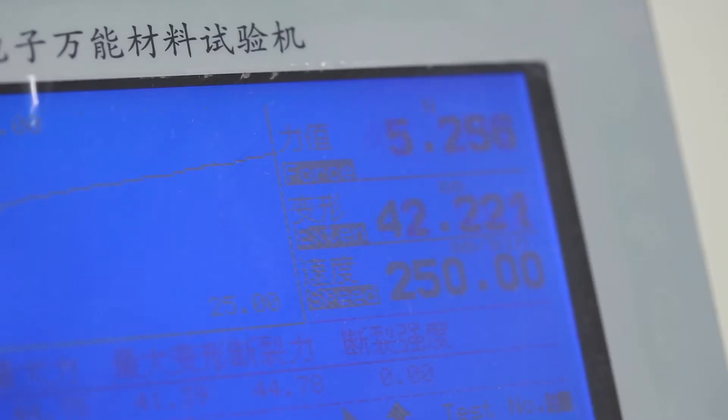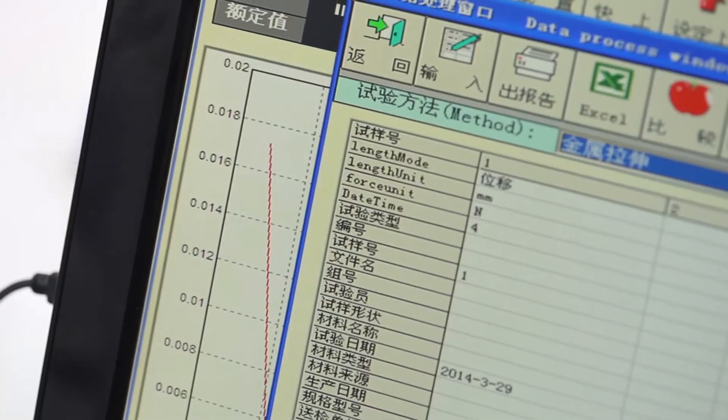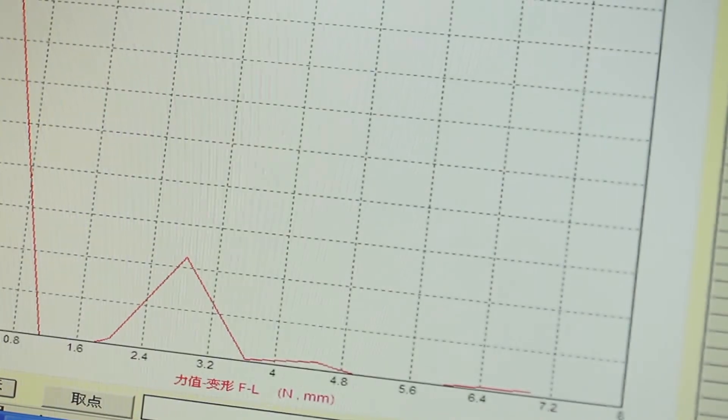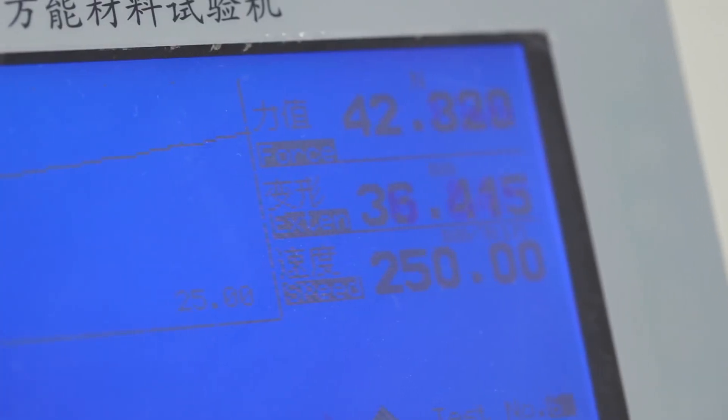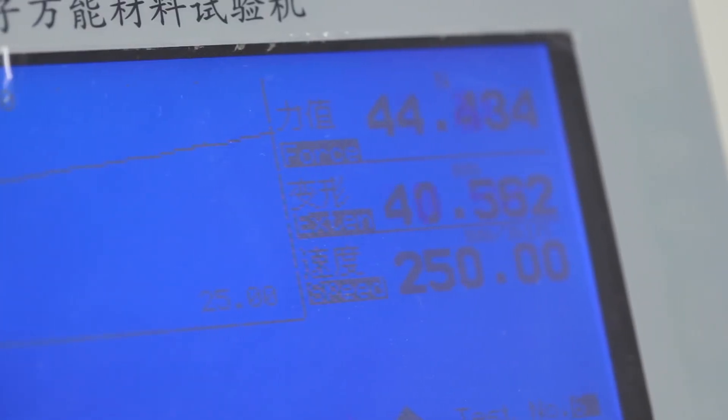User can option pneumatic clips. Different clips are optional for different tester functions. It has three levels of safety protection and is safe to operate.